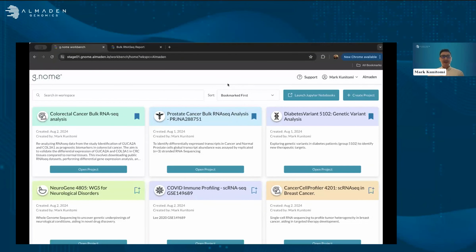What Genome does is allow you to get to these types of analyses and these types of iterations without all of the intervening pieces that are so frustrating in trying to run analyses on the cloud, trying to manage all of your data, trying to get individual tooling to install correctly, and trying to get your cloud ability to scale to the data that you want to analyze. Genome removes all of those processes and really allows you to just focus on the data, its quality, and its interpretations. So with that, I'm going to stop, and I'd love to take any questions that you may have.